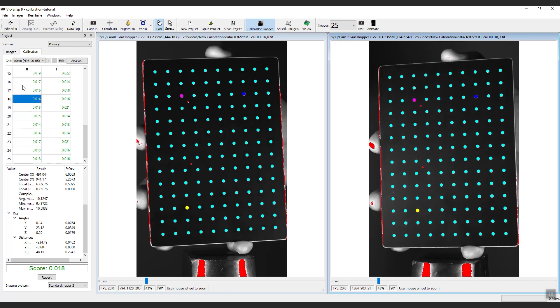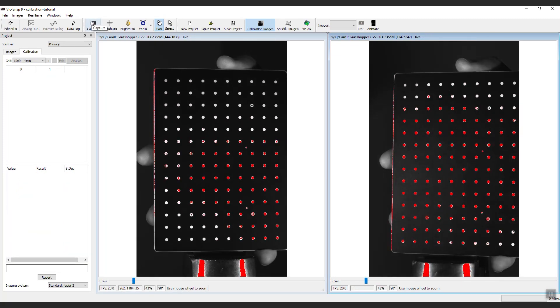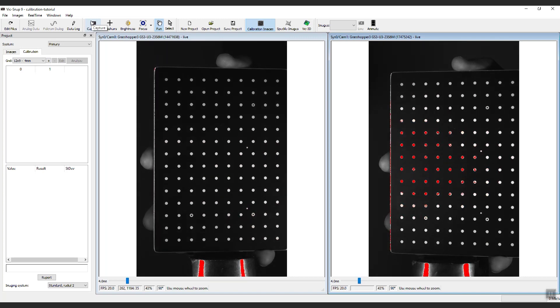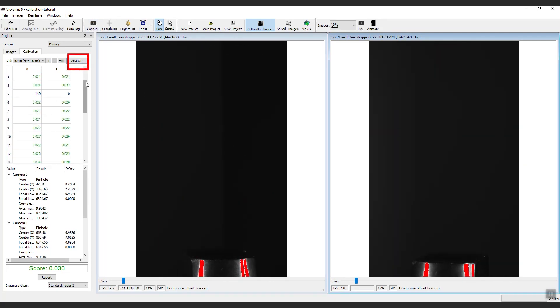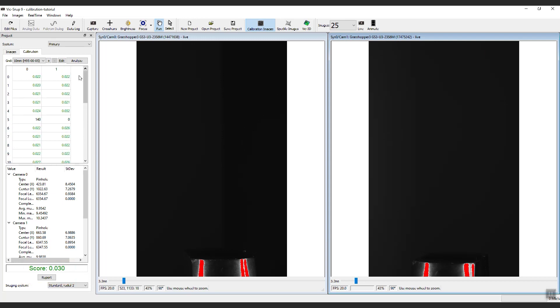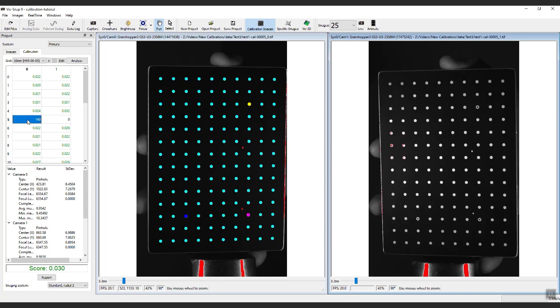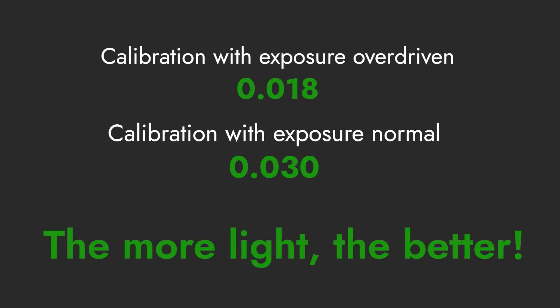In this case, we have a great score. Now let's reduce the exposure and compare the quality of the calibration. We will lower the exposure so that we see no red dots at all. After taking another set of 26 images, click Analyze and we can see the score is now 0.030. This is still acceptable, but almost twice as high as the previous example. If we dig into the details, we can see that the program has a more difficult time calibrating and more image pairs are dropped, and the individual scores are higher as well. This successfully illustrates our mantra: brighter is better in DIC — the more light, the better.